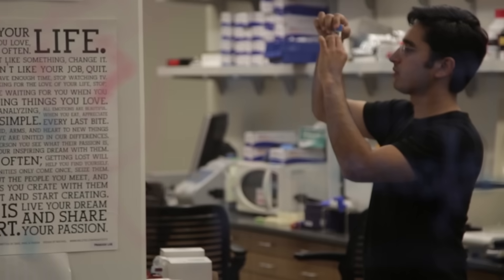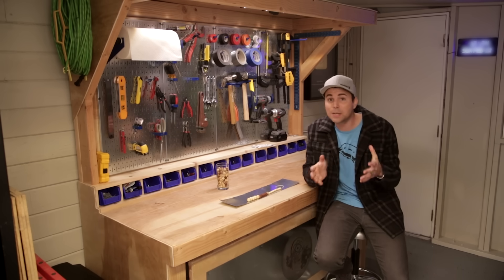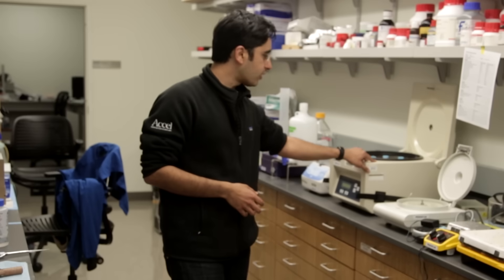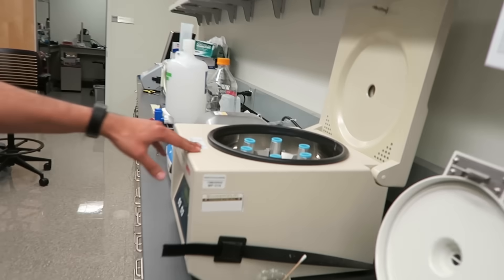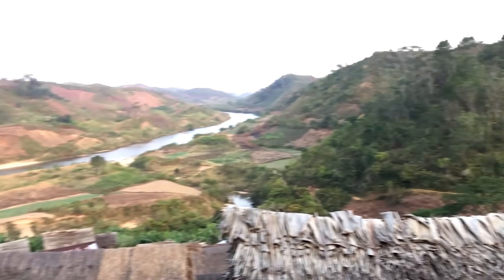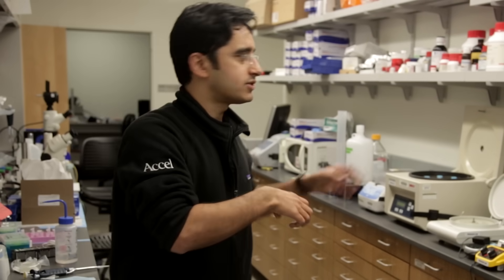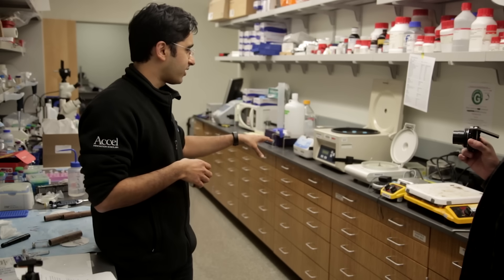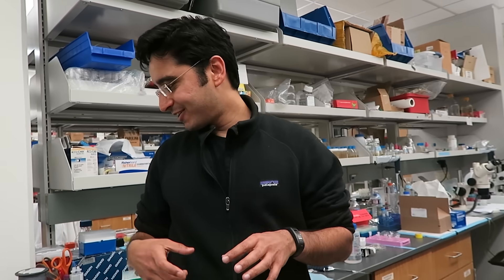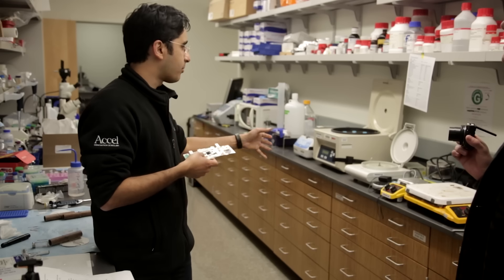I went to the lab to talk to Manu's colleague Saad, to see how they applied their frugal science philosophy to this typically really expensive piece of equipment. These are traditional centrifuges. These require electricity, and you can see how massive they are. Imagine if you had to carry this on your back in a resource-limited setting like India. You can't use something that costs thousands of dollars and requires electricity. We had a full scope out there, but you couldn't just take blood or urine or stool and process it — that became the bottleneck.